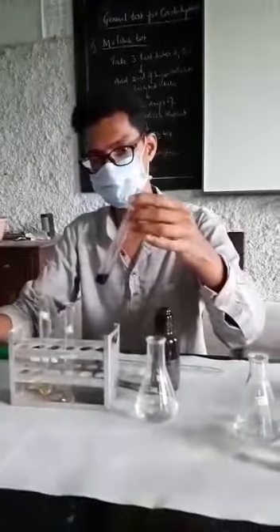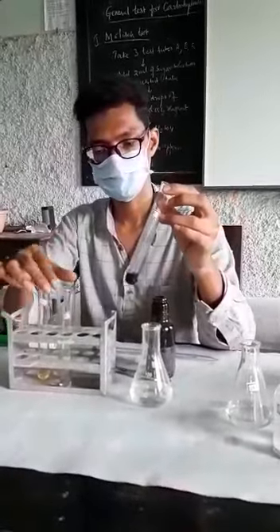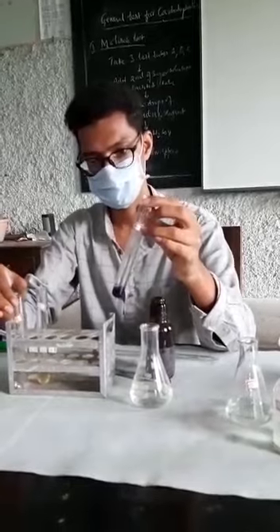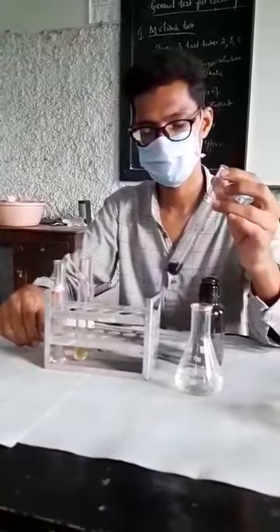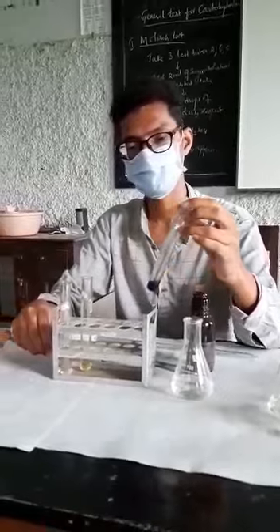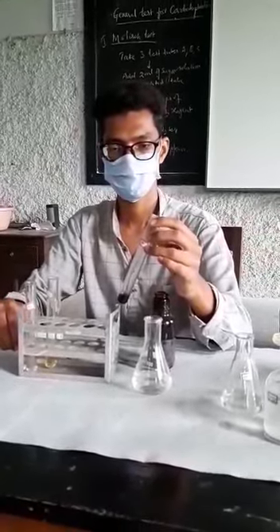Wow. He has observed that in sample A there is starch, the presence of non-reducing sugar starch, that's why he could get the blue color. But whereas in B and C, there is no starch, that's why there is no change in the color. Okay, wherever you find the change in color to blue, that indicates the presence of starch. This is done with the help of the iodine test.